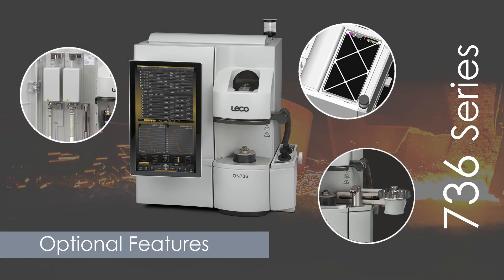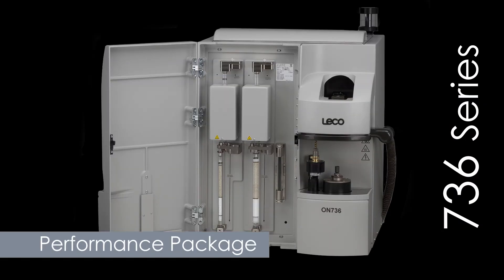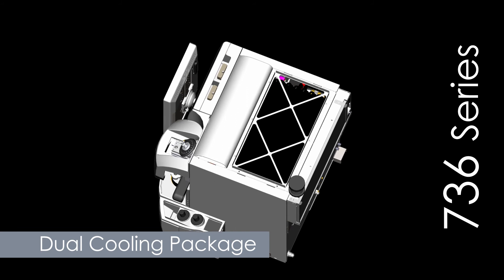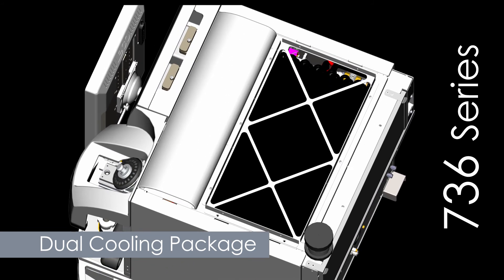Optional features allow you to customize the 736 to fit your unique needs. Choose from options such as a performance package, which adds a 3-stage carrier gas purification system, gas dose calibration, and enhanced furnace control. There is also an optional dual cooling package for your choice of liquid-to-liquid cooling, liquid-to-air cooling, or a combination of both.